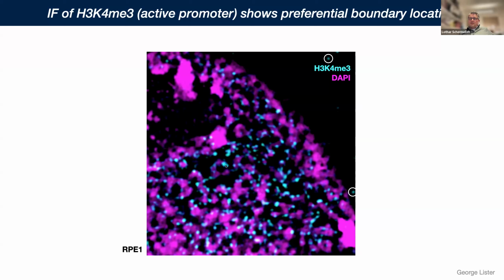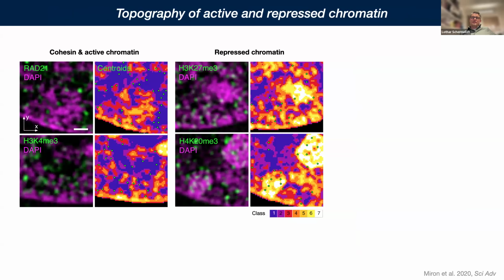So they're not in the interchromatin space, they're not in the inside of domains, but very much here at the outside.